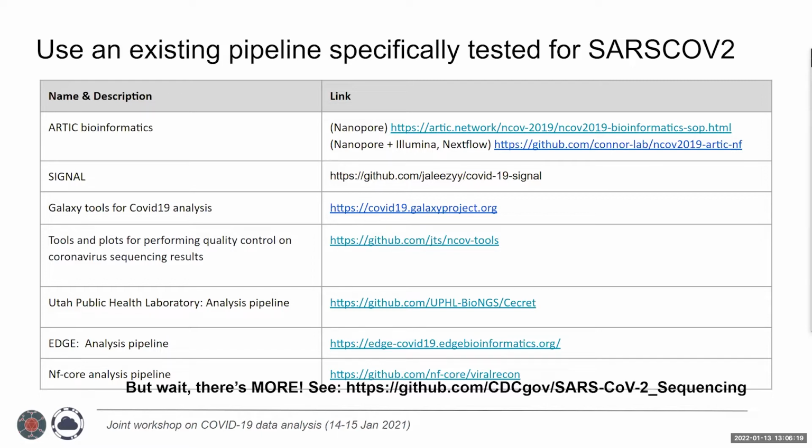That being said, one area is you might need to do your own bespoke analysis as well. So this is when you're doing, say, outbreak surveillance and things like that. When you're looking at a specific scenario, you might need to dig in the data yourself. But usually your baseline tools are these basic pipelines you can use that will give you a consensus sequence, a mapped file that you can start to play around with to answer the scientific questions.